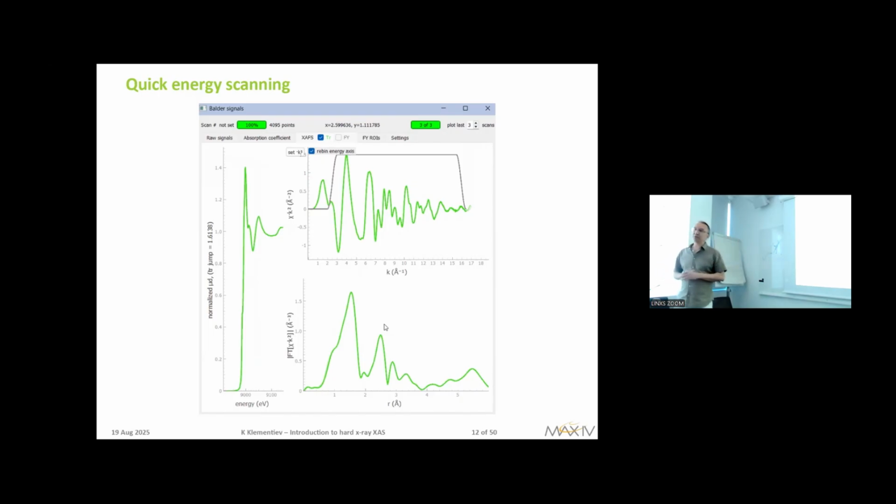That's why they measure several repeats to tell the quality is good, noise is low, and repeatability is good. So then, in principle, this is it. After a few seconds, you move to a new sample or to a new condition of the sample. Frequently, we do something with the samples in situ, we heat up or do some chemistry, electrochemistry, whatever. In this case, this is a simple reference sample. This is copper oxide. We use it for analysis of other spectra of your interest. All right, so this is it from the experimental point of view.